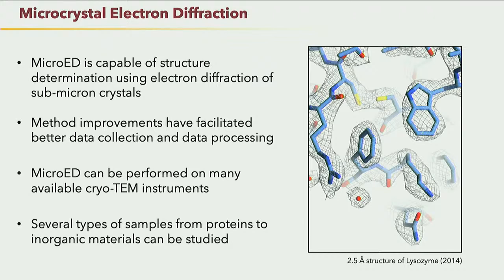You've got service centers going up all over the place that are just accepting samples from pharma and solving structures using electron diffraction. And the nice thing is, as more people use it, it's not only 2 or 3 labs in the world developing it, but a lot of people, and you'll hopefully see this method improvement I'm talking about start to really take off as more people start to work on it.